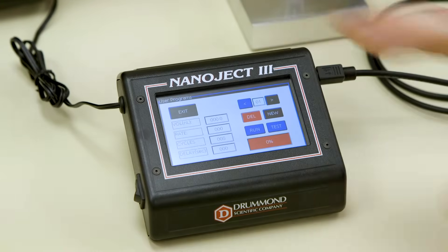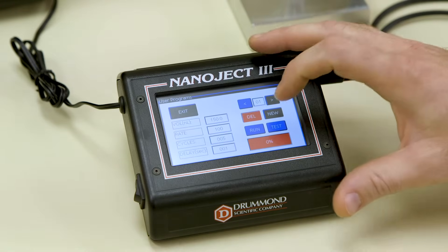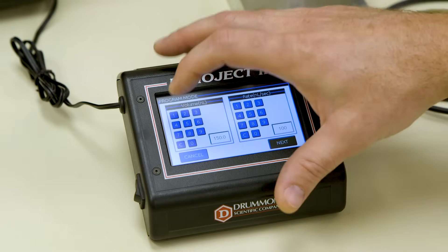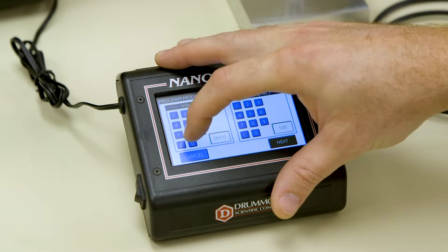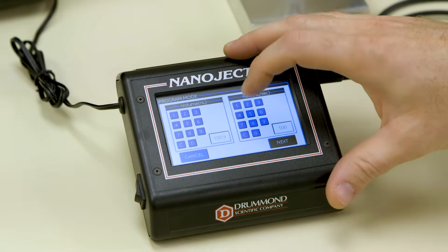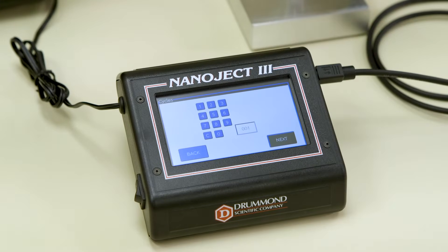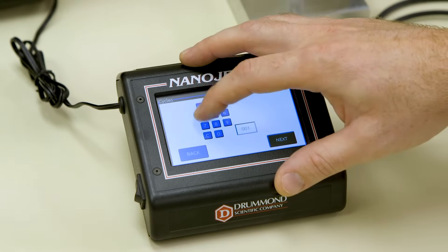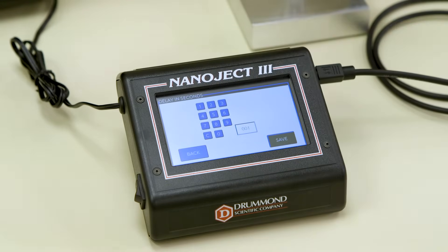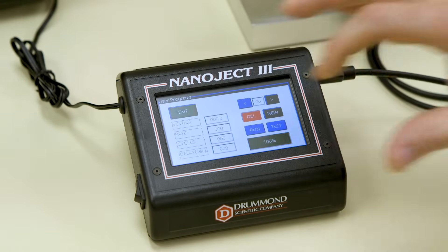Next up is the Program mode. This mode allows the user to create multiple injection cycle recipes. Select New, choose your volume and your rate of injection, then press Next. Then choose Cycles, Number of Injections, and press Next. Then choose the delay between each injection in seconds and press Save.